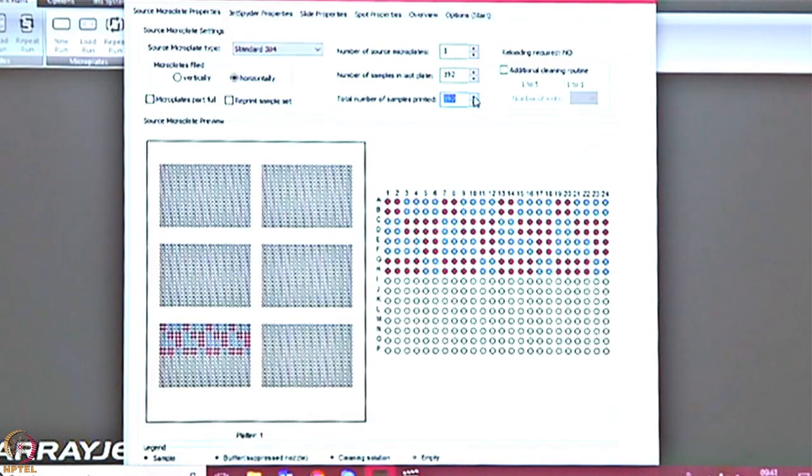Because there are so many different applications, it's actually a very interesting question, and I'll spend another 2 hours telling you how we are doing this mechanism of generating the well plate. So the jet spider needs to fill up one corner of 12. Because it's in multiples of 12, it has to finish the first 12, go to the next 12 wells, go to the bottom 12 wells, go to the next bottom 12 wells. It has to finish one section before it moves printing and takes another set of 12 samples.